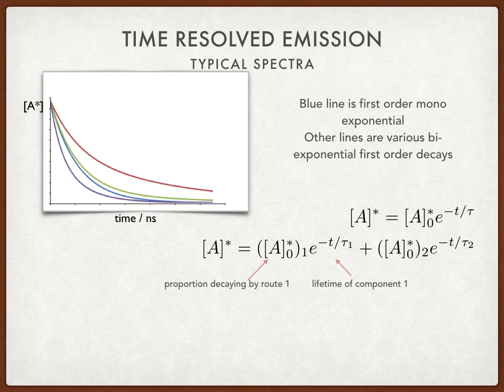Fitting these decays can be very difficult, and ultimately I would never try and fit anything more than a 3-component exponential decay. If there are more components than that, the probability of me being able to fit this by hand or even by using mathematical models is very small.